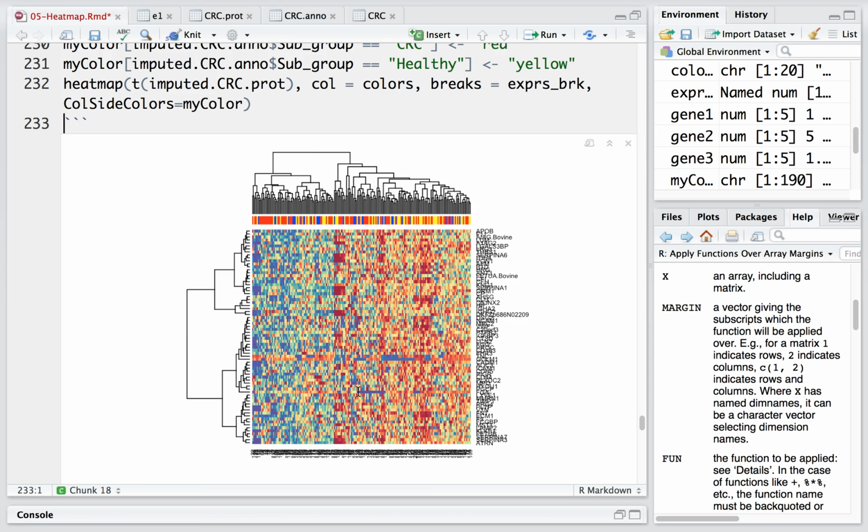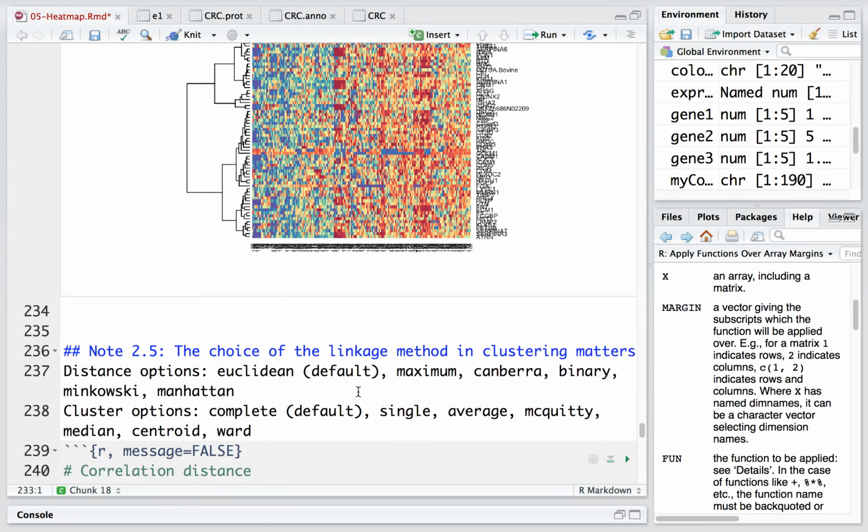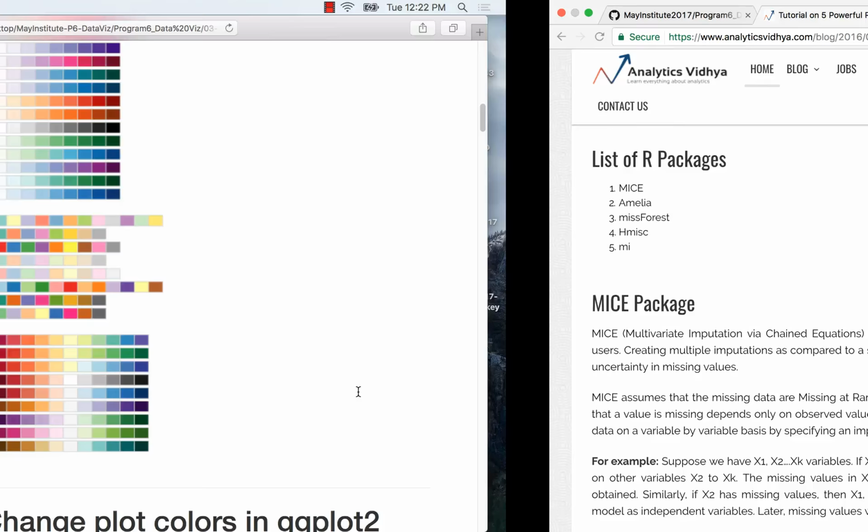Here, for the left cluster, we see there are more red colors, right? What is red color? Red color is colorectal. But for benign and healthy, it's really hard to distinguish them. But for the left side, there are more red colors, like colorectal cancer patients.